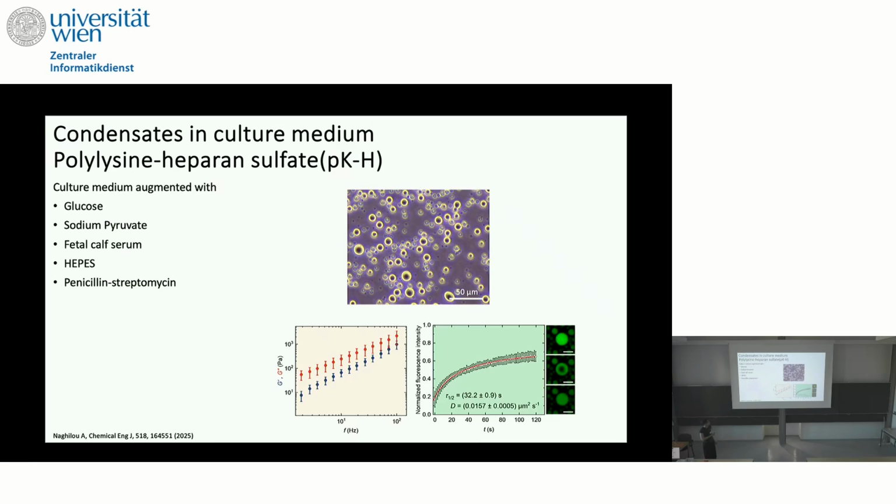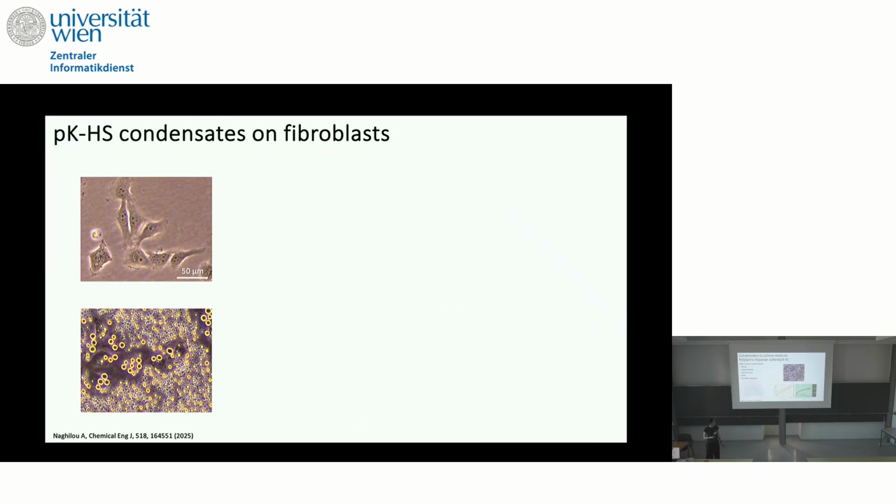We obviously also characterized them with our scanning probe microscope and with FRAP, and we saw that they are liquid also in the culture medium. And the next thing was to take some cells. Here I just took some fibroblasts. It's a cell line.